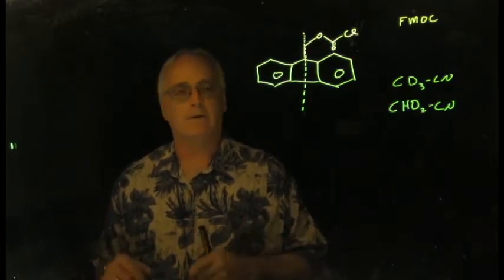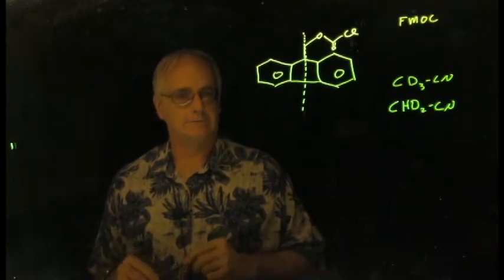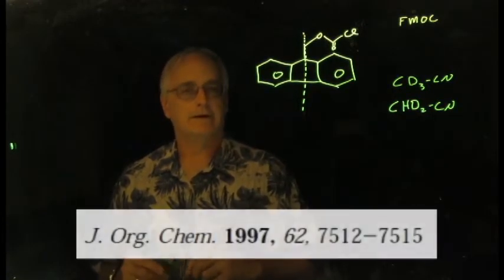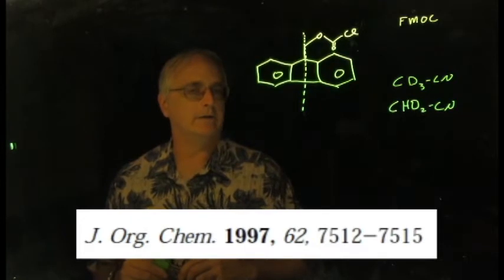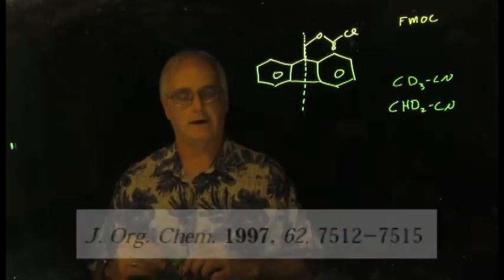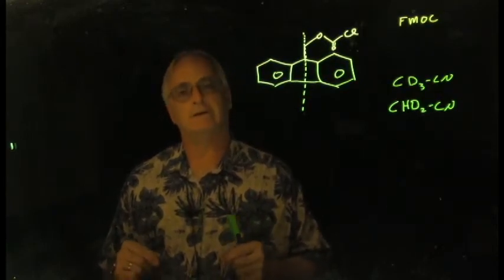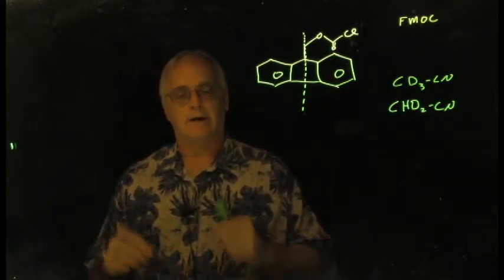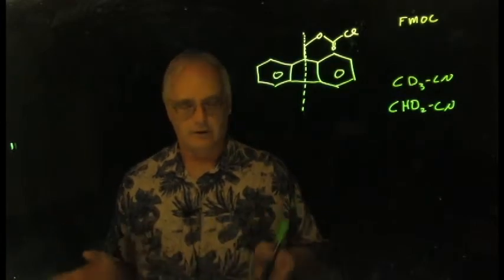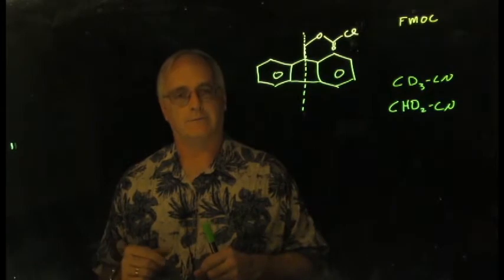Now you can find them all over the place. There's a lot of references out there. This particular article, and here's the reference to it, came out a couple of decades ago in the Journal of Organic Chemistry. It is a compilation of a lot of work in measuring residual solvent peaks and common contaminants in almost all of the possible solvents that you will ever see in NMR spectroscopy.